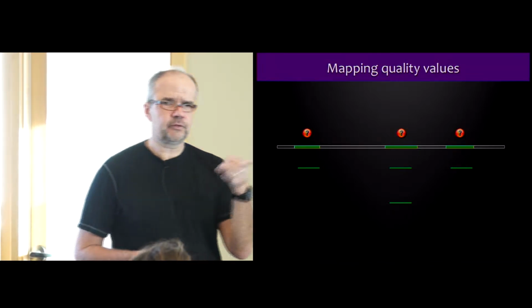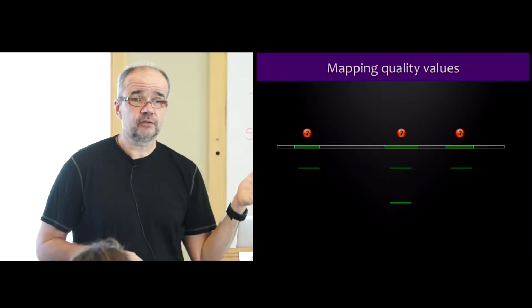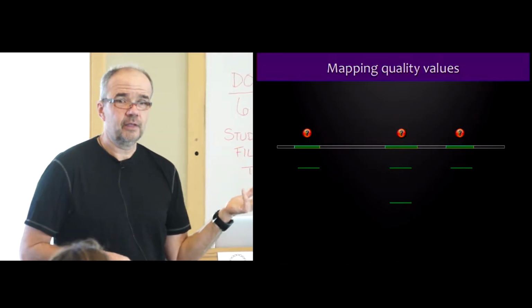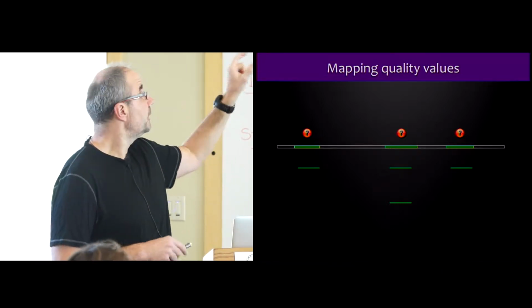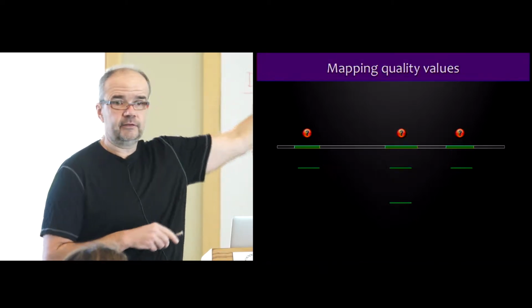Al and others have talked about various genomic data formats and talked about BAM files, right? Did you talk about mapping quality values? So the mapping quality value just expresses how sure you are that a particular piece that you placed here in fact comes from that place of the genome rather than some other place.